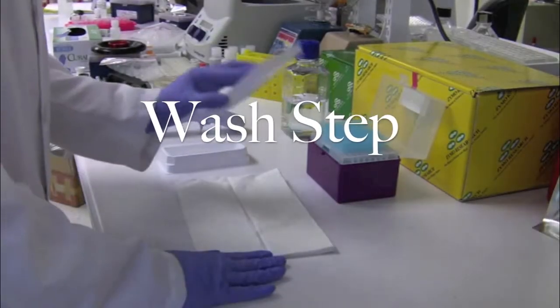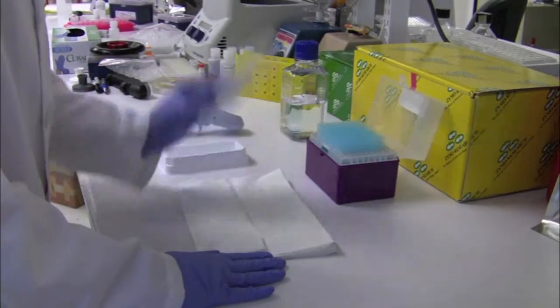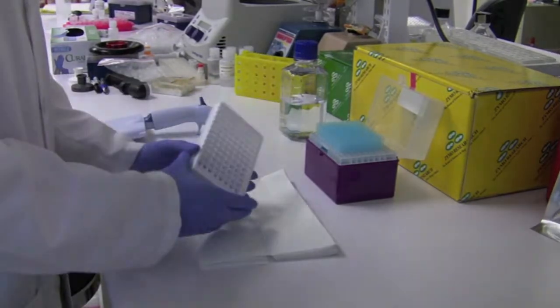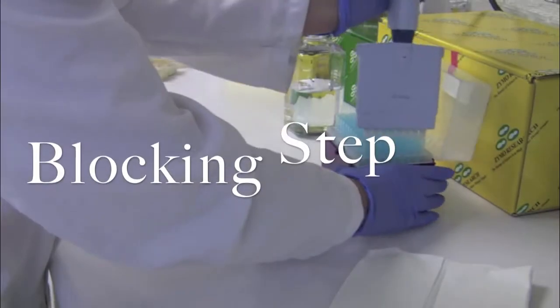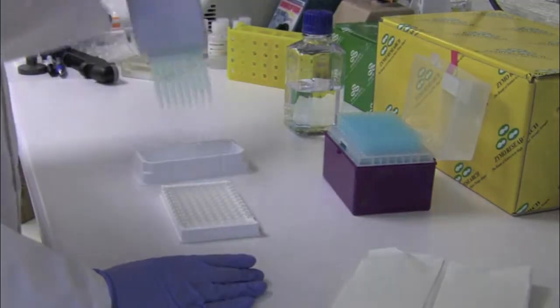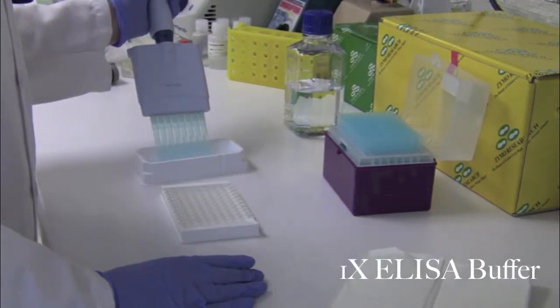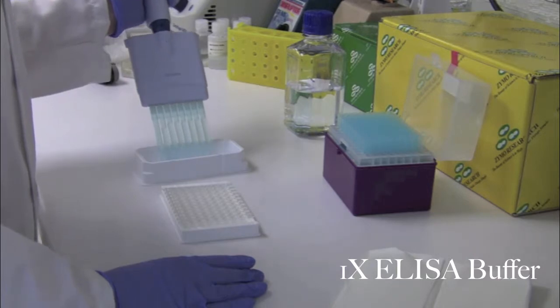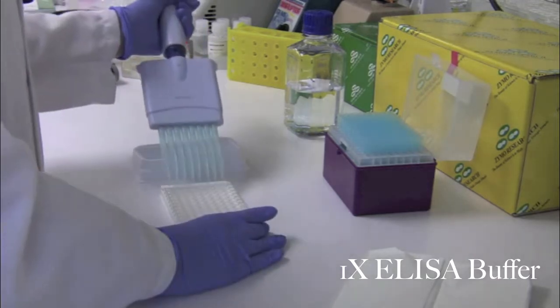Any unbound antibody is removed during the wash step. This is done by discarding the liquid and tapping the plate on paper towels. The plate is then blocked using 1X ELISA buffer in order to decrease nonspecific protein interactions. This is done at 37 degrees Celsius for 30 minutes.